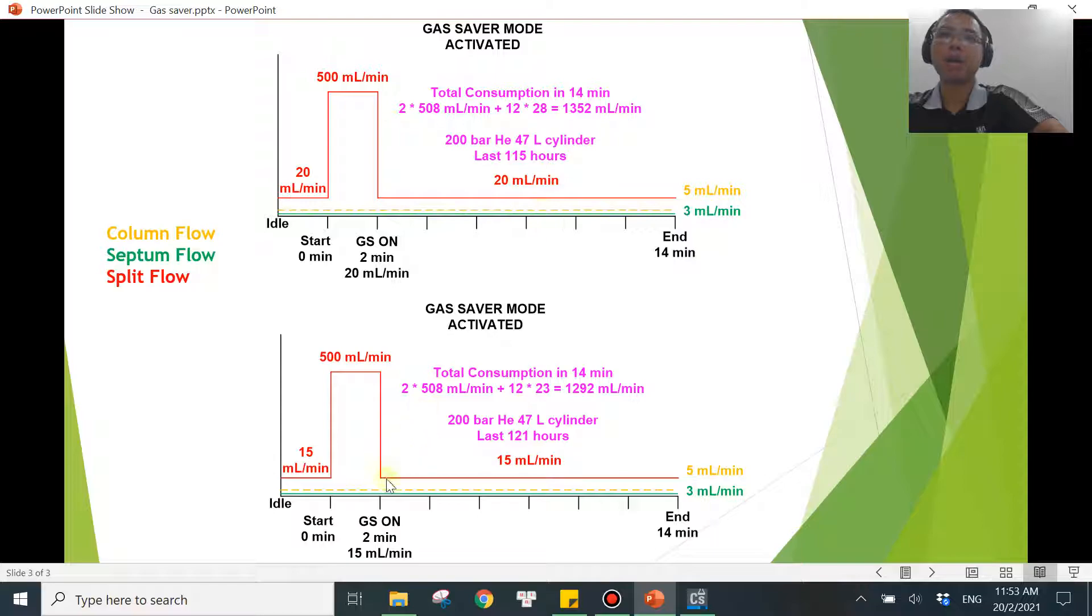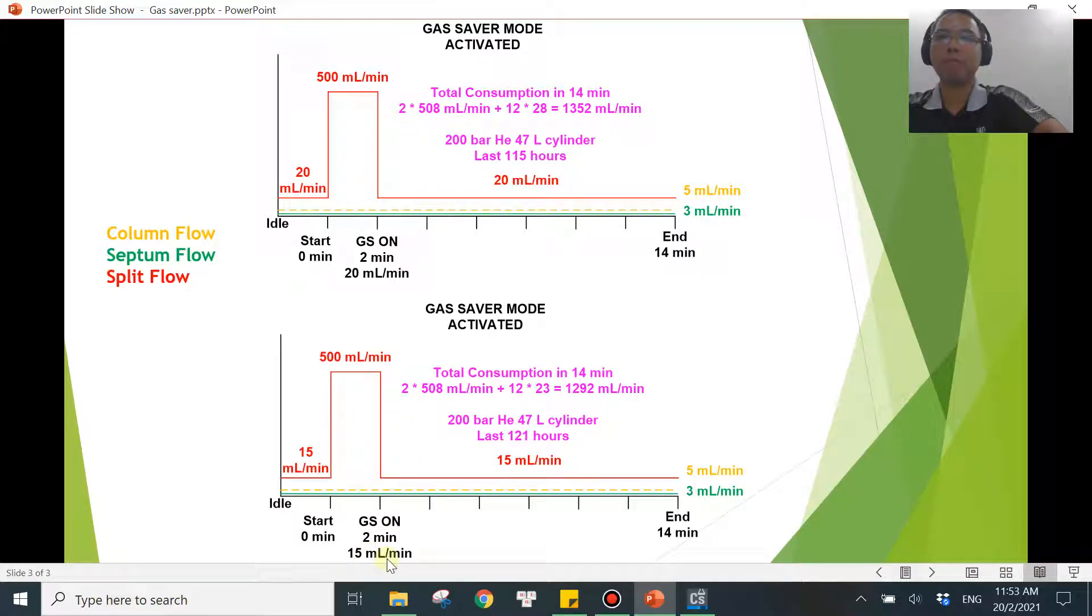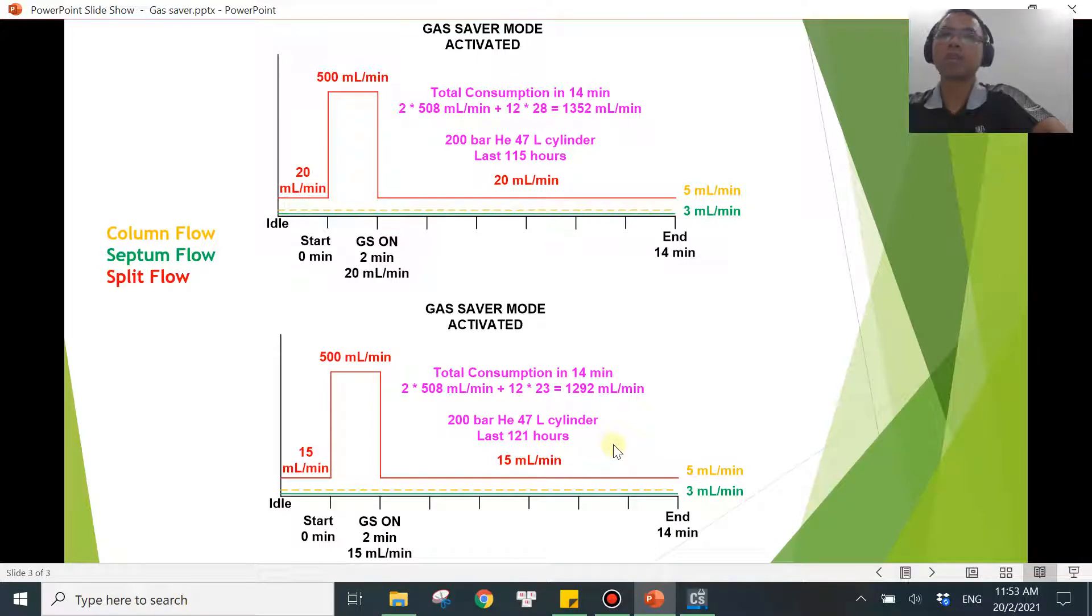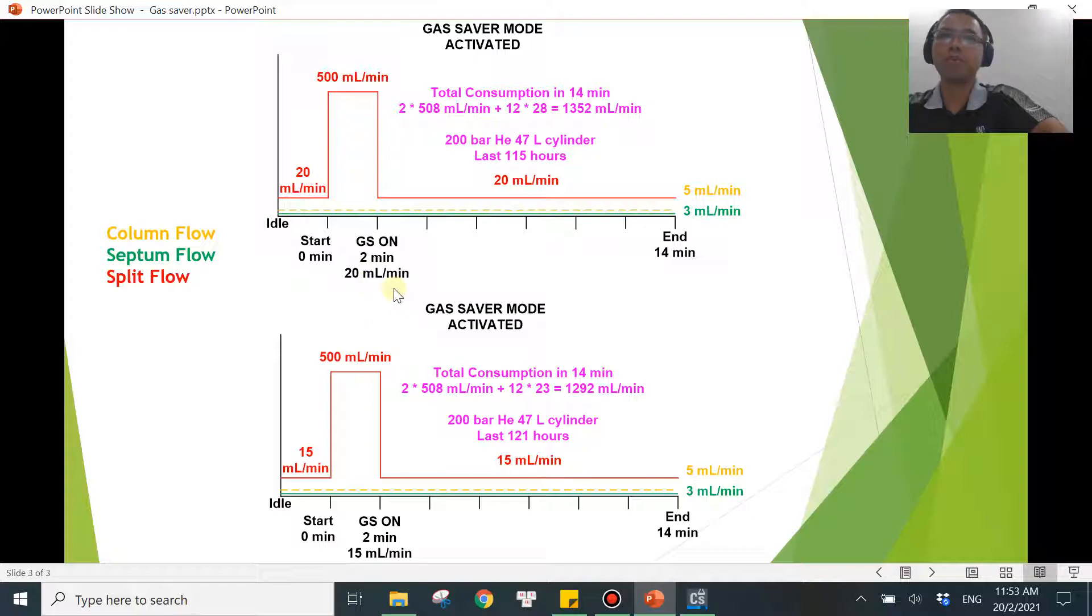But if you turn on the gas saver mode at 2 minutes but the flow rate is only 15 mL per minute, you will be able to use one helium cylinder for 121 hours. That's slightly longer. So you will see that different flow rate over here will save you more. So that's the minimum.